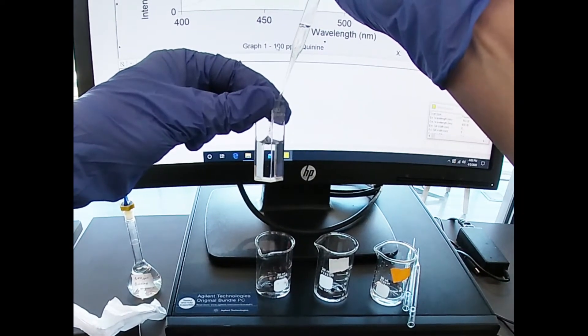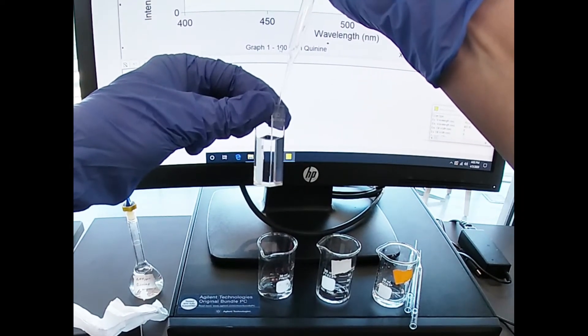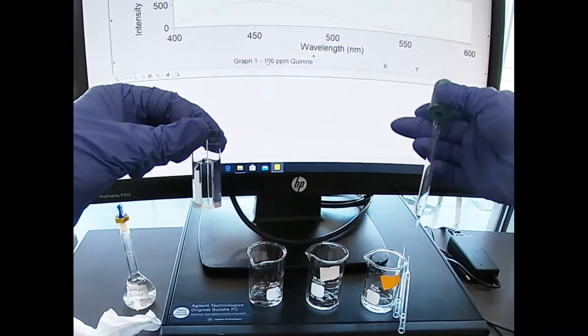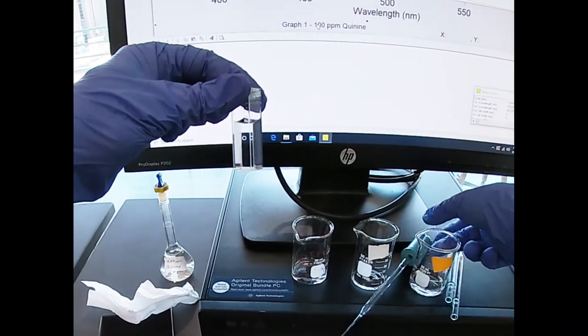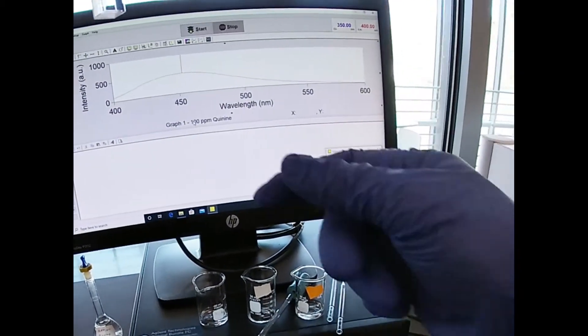We're exciting with ultraviolet light, despite the fact that the emission is at 455 nanometers, putting it in the visible range, which is why we actually see the fluorescence. It looks slightly blue.